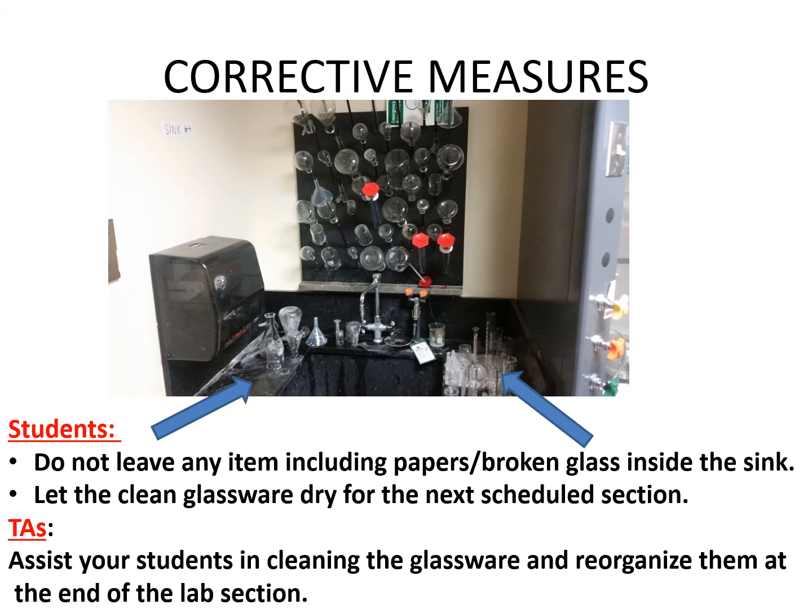Everything needs to be organized, and like I said, these are health hazards, broken glass hazards, so just make sure all the glassware is clean and as it should be.